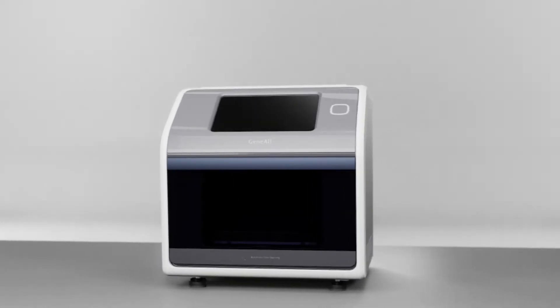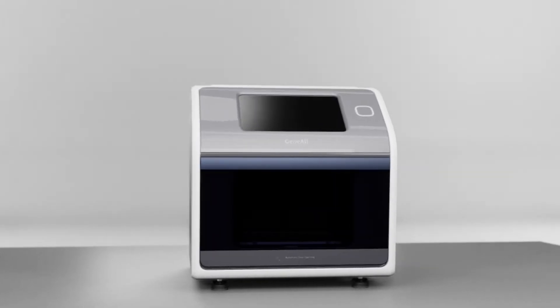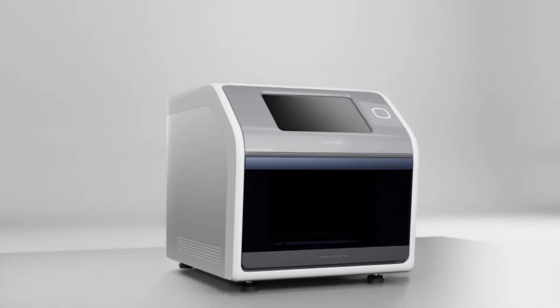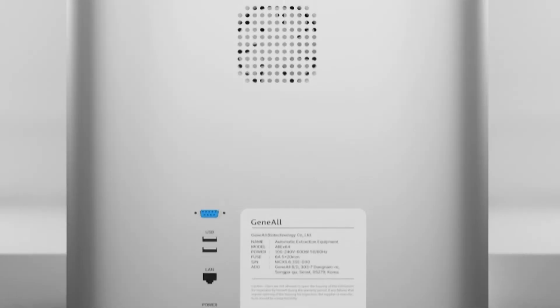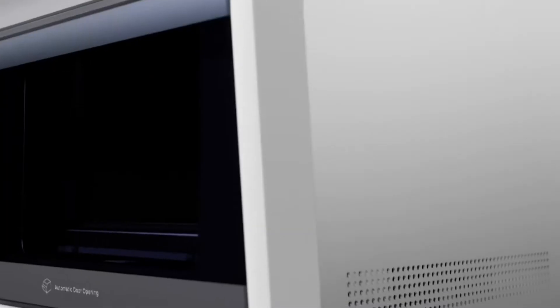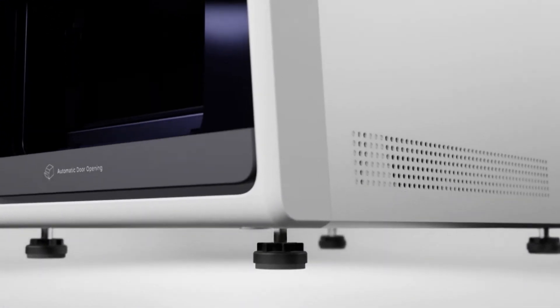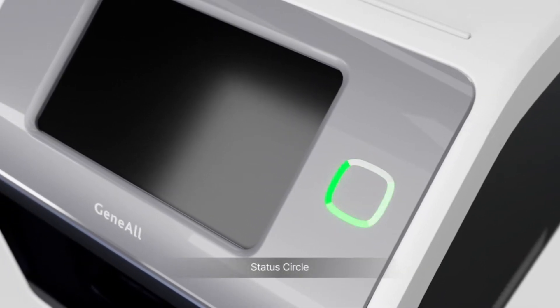GeneAll Biotechnology introduces the AllEx64, a compact but comprehensive solution for automated nucleic acid extraction. The equipment has been designed for scalable nucleic acid extraction up to 64 samples while keeping a space-saving design. The LED status circle shows visual run status.